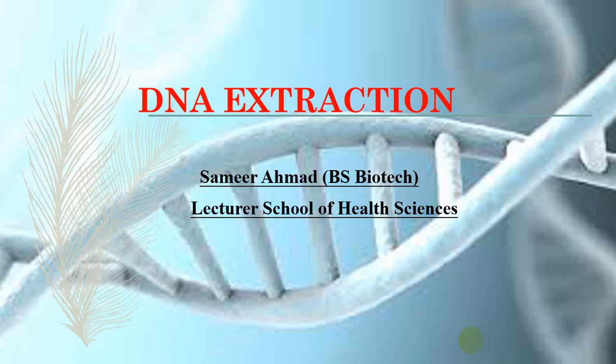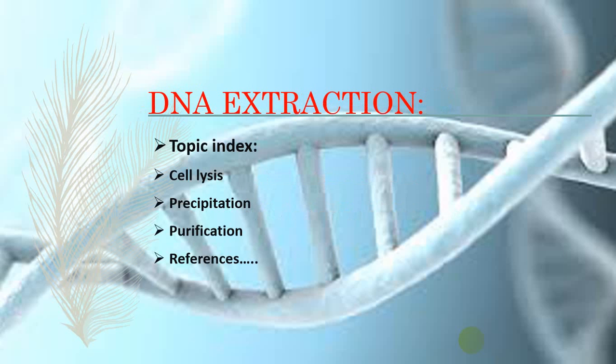So here we will discuss only the basic concept of what we actually do for extracting the DNA. Our DNA extraction topics will include cell lysis, precipitation, purification, and in the end I will add the references from where I made these slides and lecture.